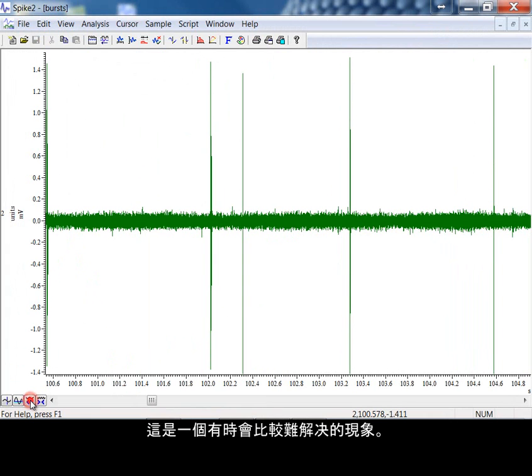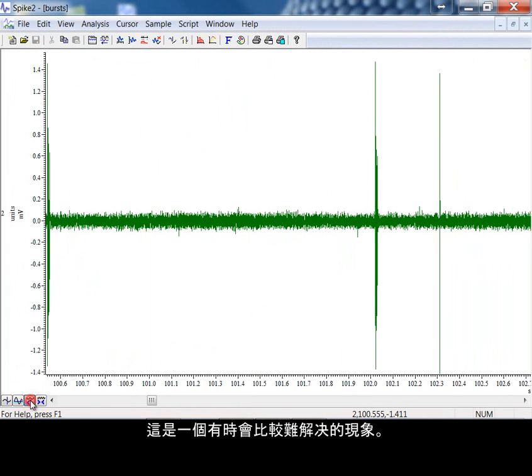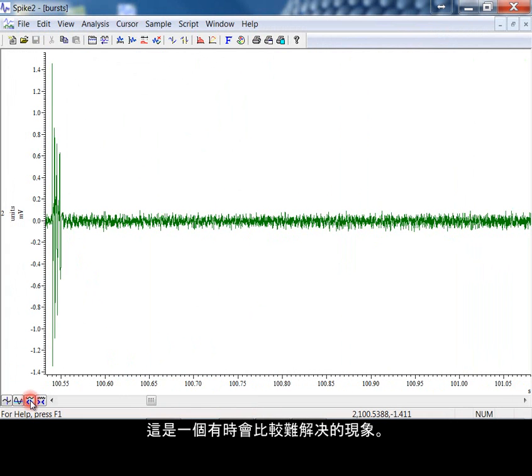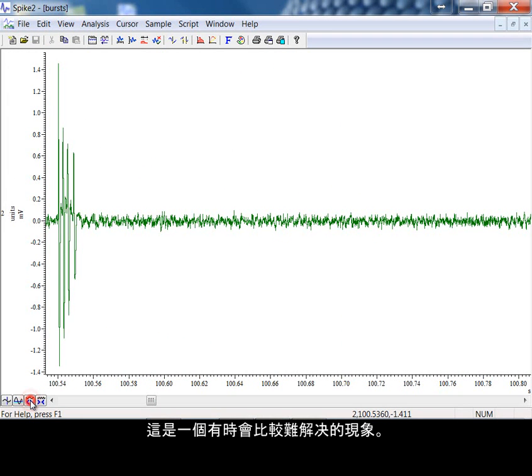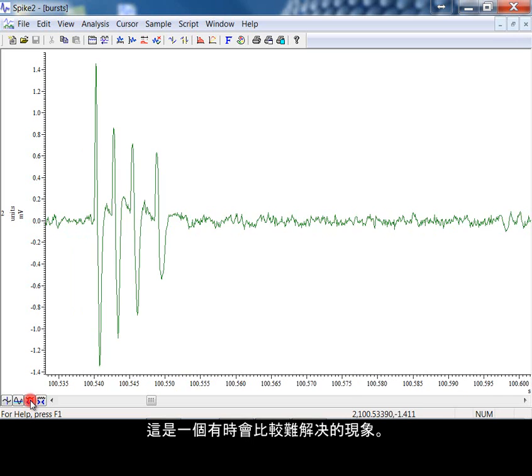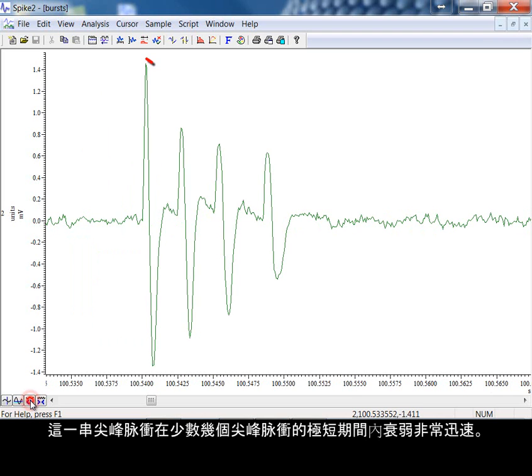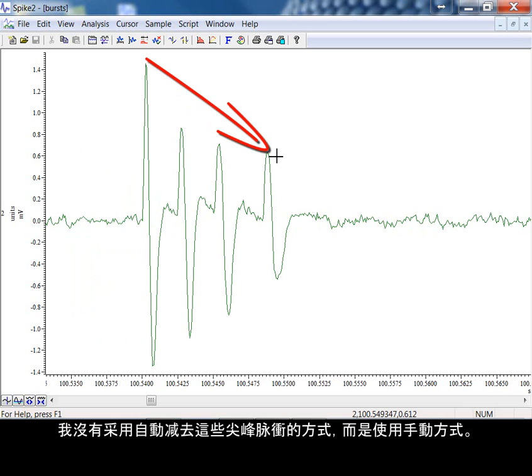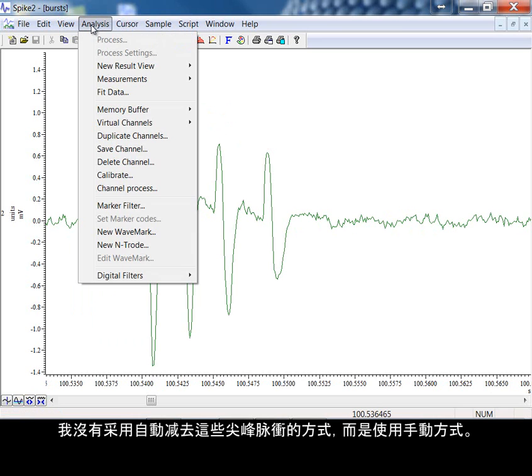One sometimes difficult to resolve situation is shown here. These bursts of spikes are decaying quite rapidly over a very short number of spikes. Instead of trying to automate the extraction of these spikes, I'm going to use a manual method.